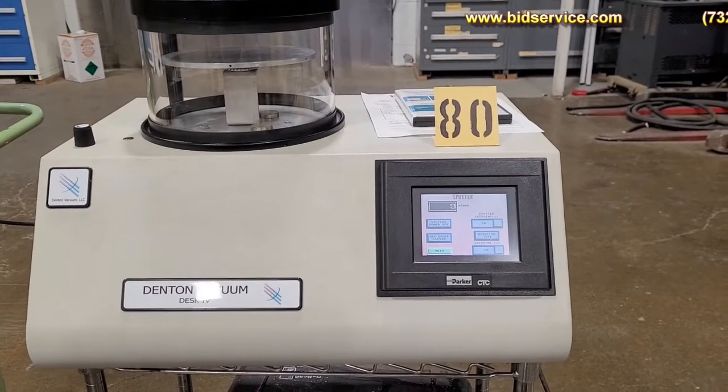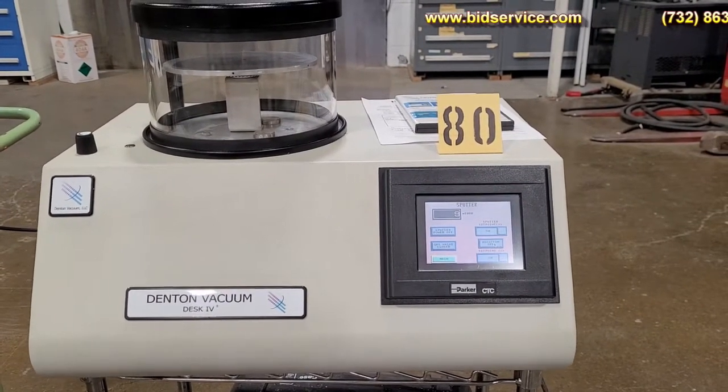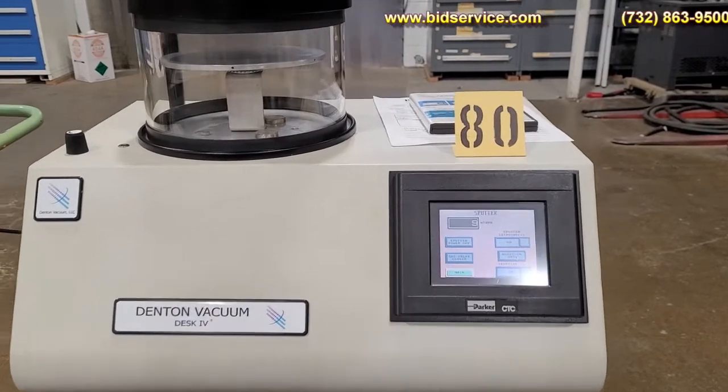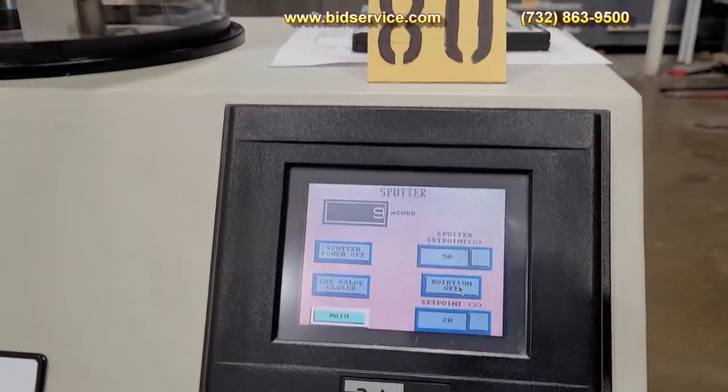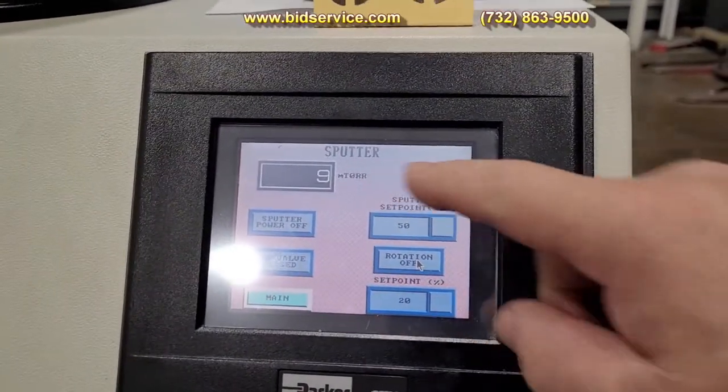This video is for the Denton Desk 4. As you can see, I'm right now pumped down on the system, and I'm right down to 9 millitorr.